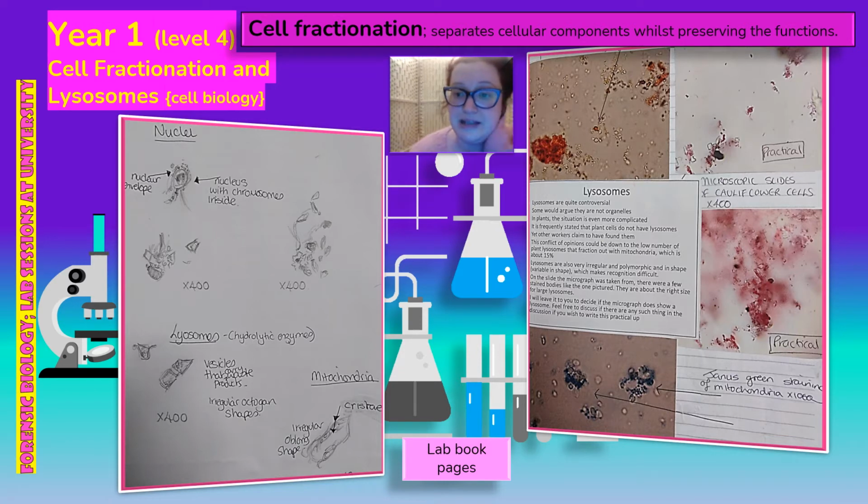But it was a really interesting piece of coursework, and I did this for first year. It was really tricky because it was something that I didn't really understand, but now I do. So they're really, really interesting. And just importantly, to point out that the microscope lens was times 400, which is really crucial because there are different types of lenses that can see different types of things during a microscope. And I also learned how to use a microscope, so there you go.